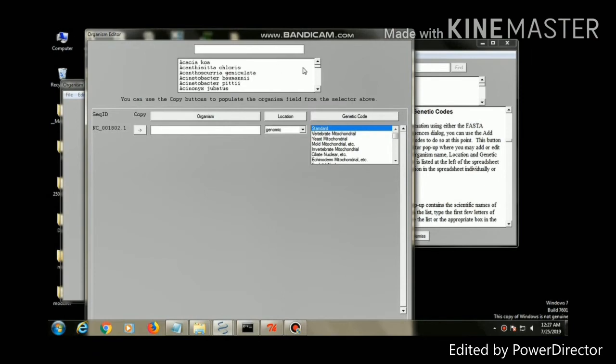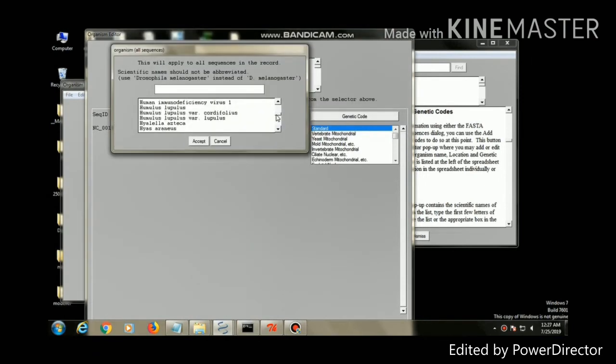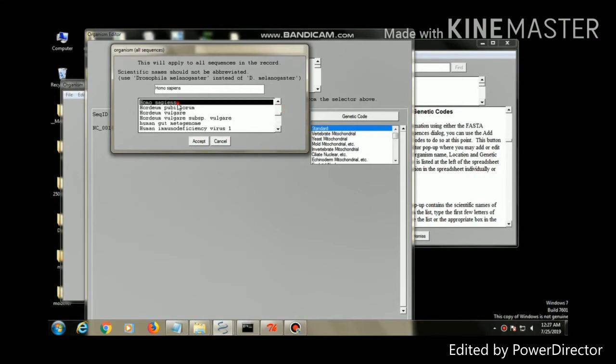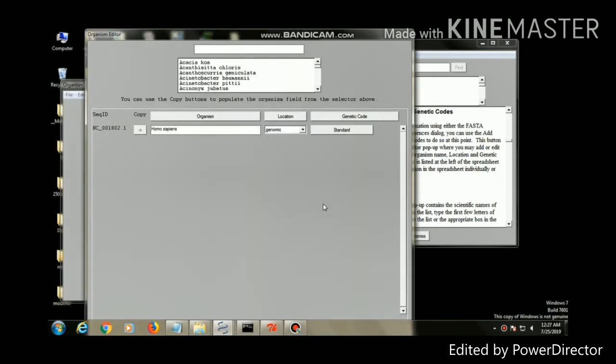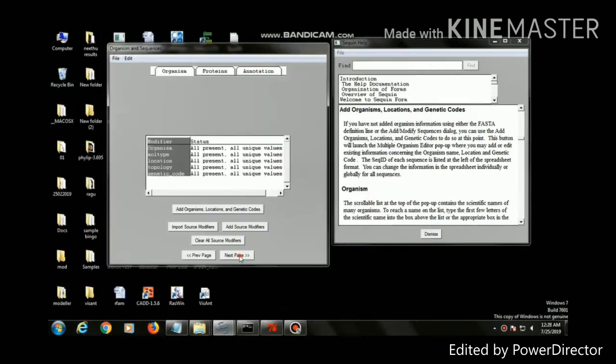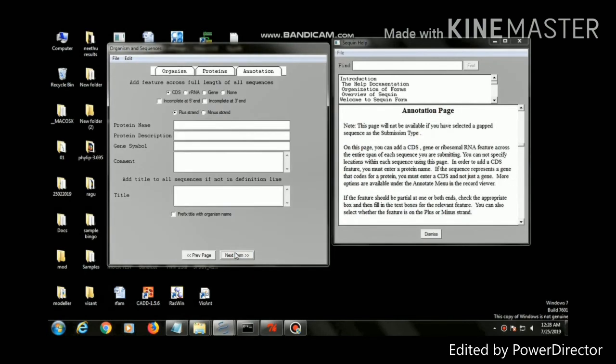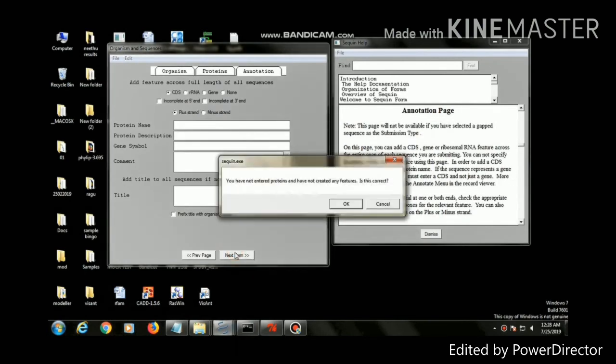Click next page. The next page is the organism page. Information about the organism from which the sequence was derived should be entered or edited on this page. Then click next page.